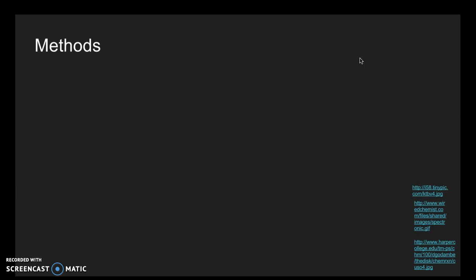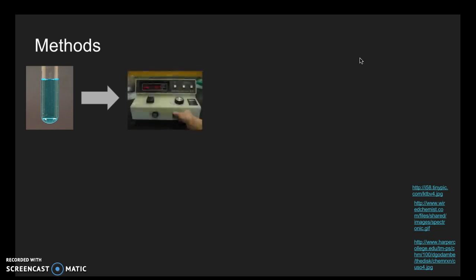In labeled test tubes, each molar solution is poured into the corresponding test tube. From these test tubes in a graduated cylinder, measure 7 milliliters of the first solution for a test tube or 3 milliliters for a cuvette. The test tube or cuvette that will be used each experiment should be cleaned before each use. A direction the test tube or cuvette goes in the machine is determined, marked, and used every time. The cuvette is put into the spectrophotometer and absorbance is recorded.